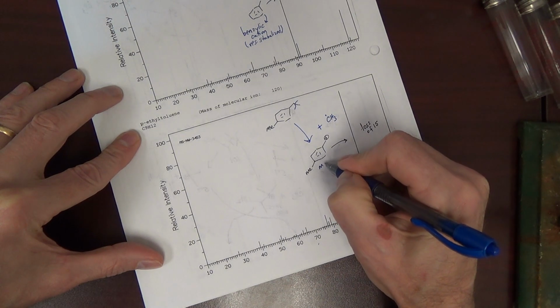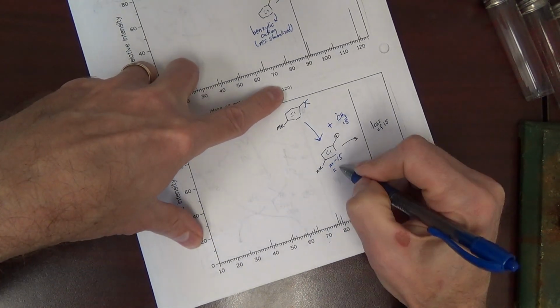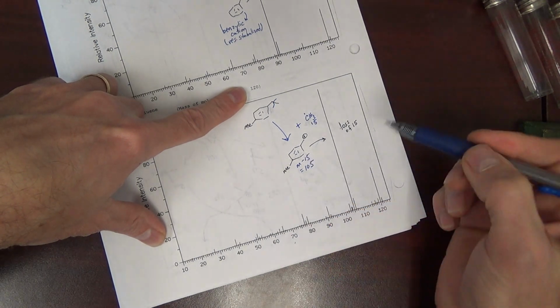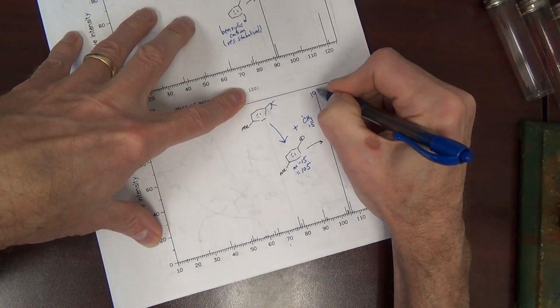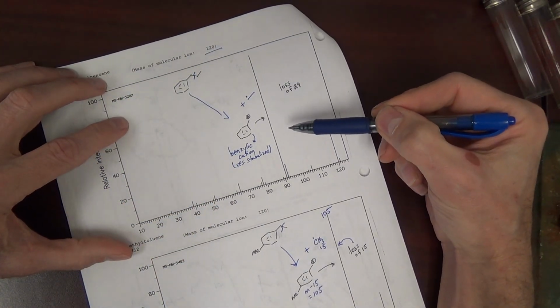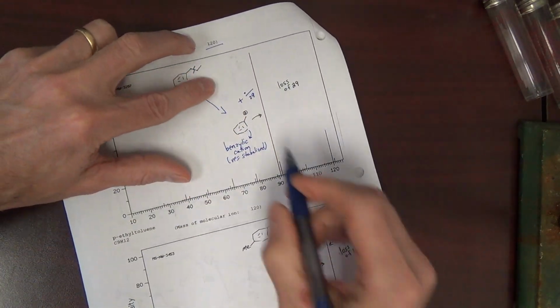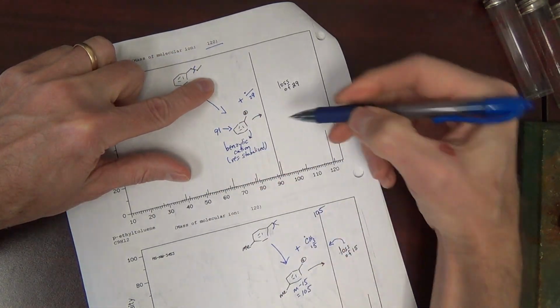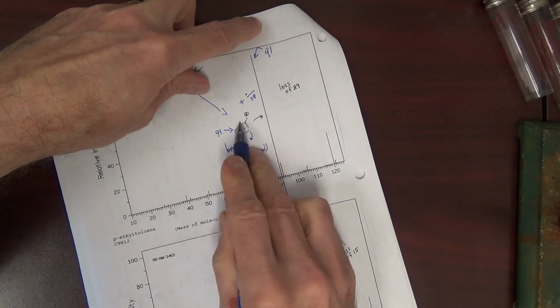This cation is M minus 15 because we just lost the 15 radical, which is 120 minus 15, 105. Do we have a 105? Yes, it's our base peak. 105, base peak. Where up here, we didn't predict a 105. We predicted a, what did we lose? We lost 29. 120 minus 29 is 91. We predicted 91 here, and indeed, we have a base peak of 91. That's what we would predict.